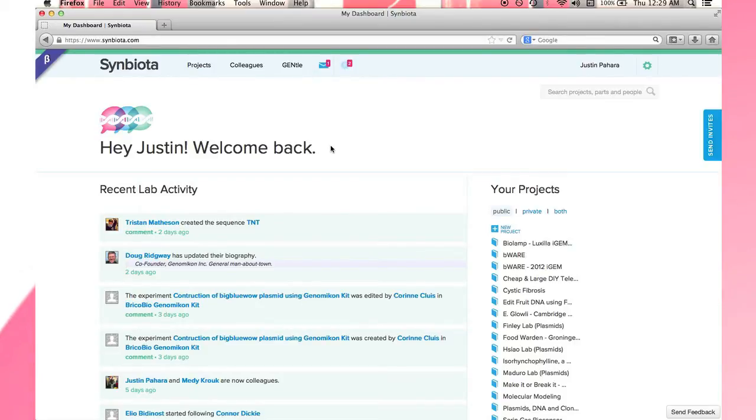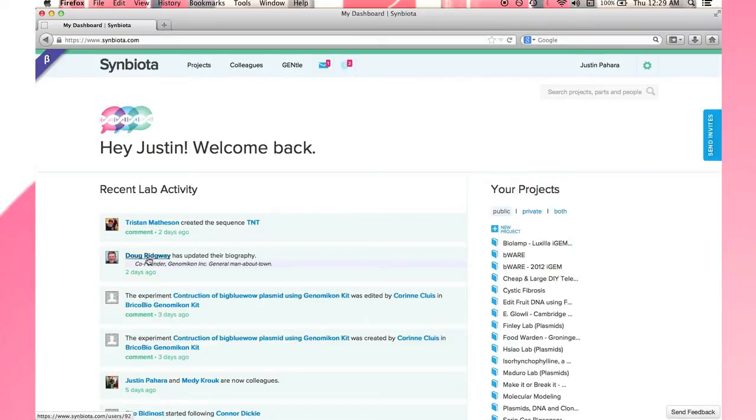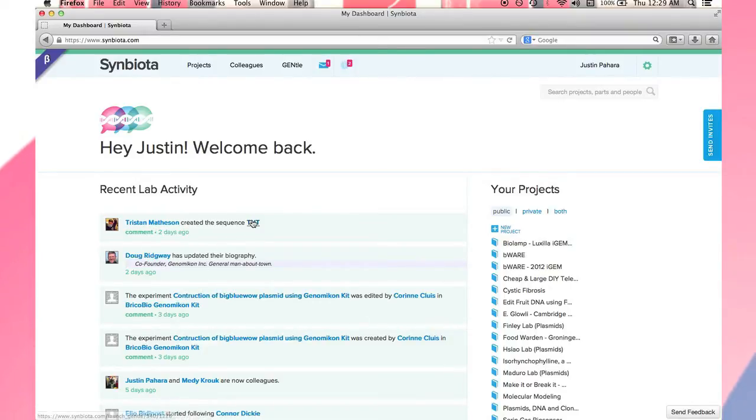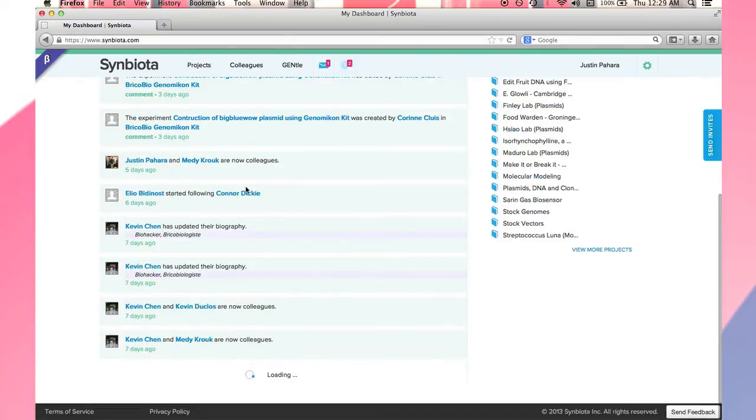The first thing you notice when you sign in is the recent activity feed. This is where you see the actions of your colleagues and collaborations. Actions include profile updates, creation of lab book entries, DNA sequences, new projects, and much more. This feed provides you with full awareness of the people and progress within the projects that you are part of.